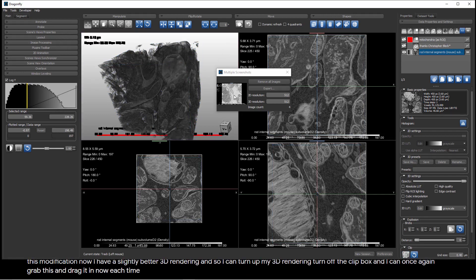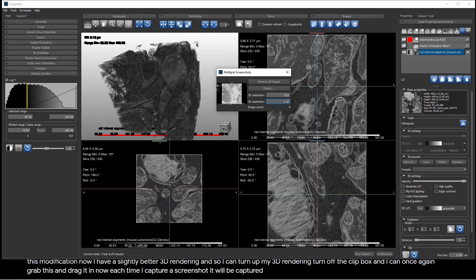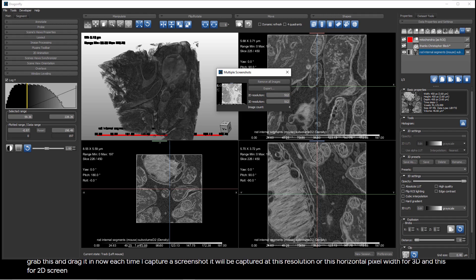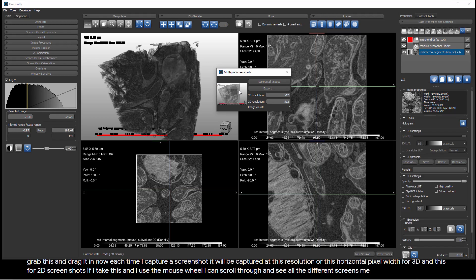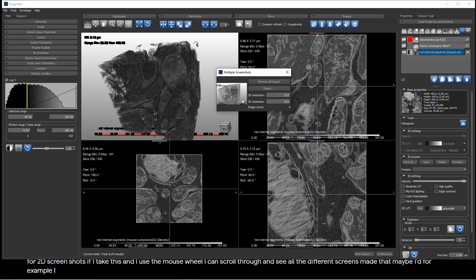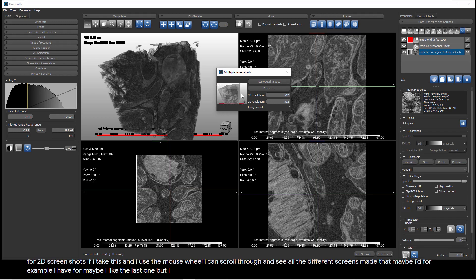Now, each time I capture a screenshot, it will be captured at this resolution, or this horizontal pixel width for 3D, and this for 2D screenshots. If I take this and I use the mouse wheel, I can scroll through and see all of the different screenshots. So, I like the last one I made, but maybe I have four. Maybe I like the last one, but I don't like the one before it. I can right-click and remove that image.